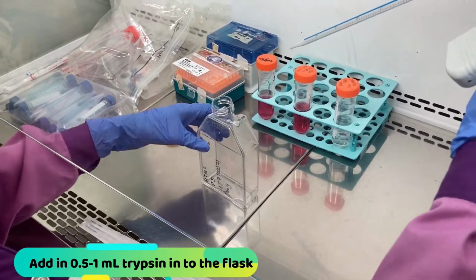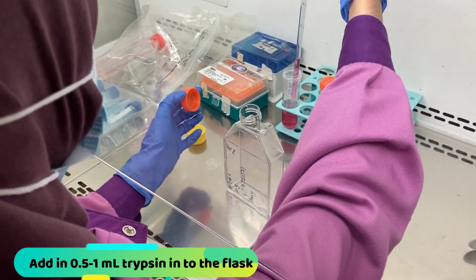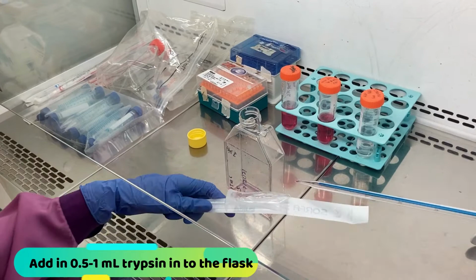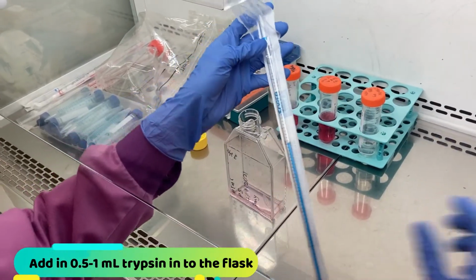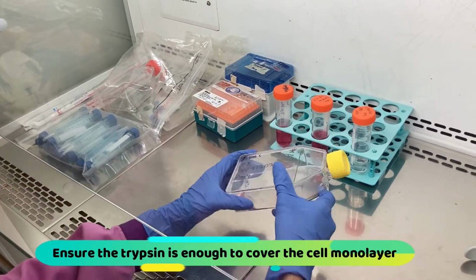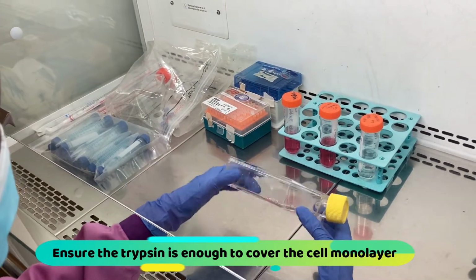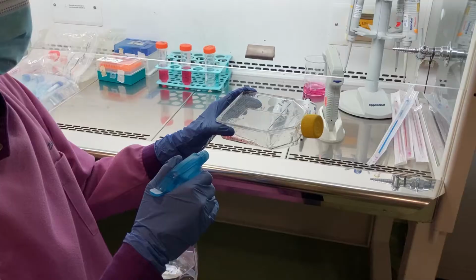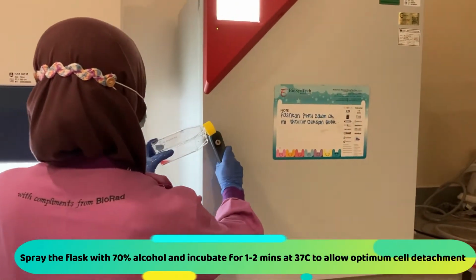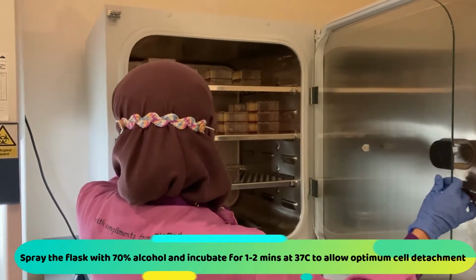The next thing you need to do is to add in 0.5 to 1 ml of trypsin into the flask. The volume of trypsin depends on the size of the flask that you use. Ensure the trypsin is enough to cover the cell monolayer. Make sure you spray the flask with 70% alcohol and incubate for 1 to 2 minutes at 37 degrees Celsius to allow optimum cell detachment.